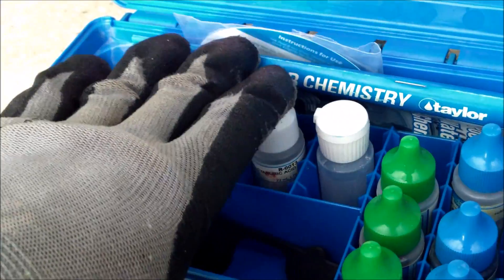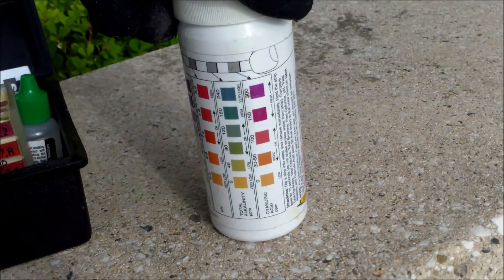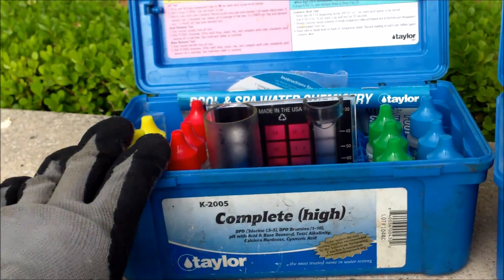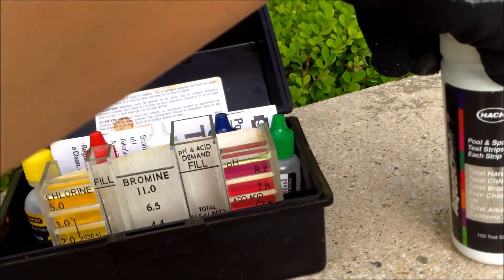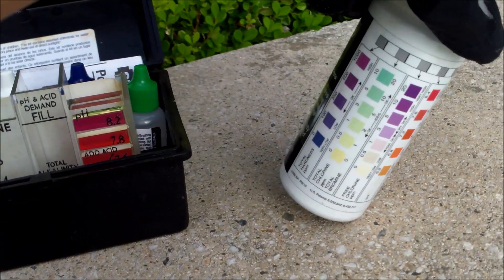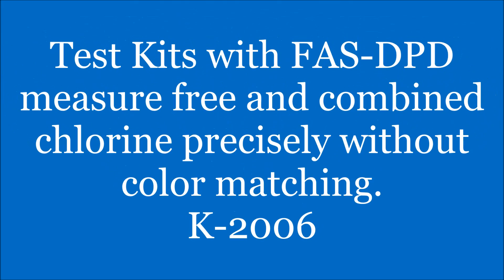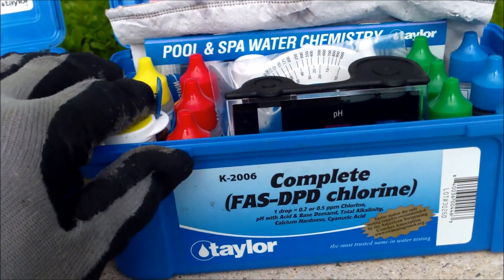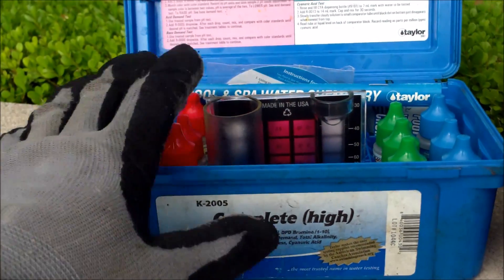In addition to that, both Taylor kits can also do a conditioner test, and the AquaCheck 701 also does a conditioner reading. The advantage of the Taylor kits is that they also do a combined chlorine reading — the 5-in-1 test kit doesn't do that. The AquaCheck does give you a combined chlorine reading: it gives you total chlorine and free chlorine, and that's how you can tell if you have combined chlorine. The K2006 gives you the best combined chlorine reading because it uses the FAS-DPD test. With the K2005, the combined chlorine is a little harder to see in the test.